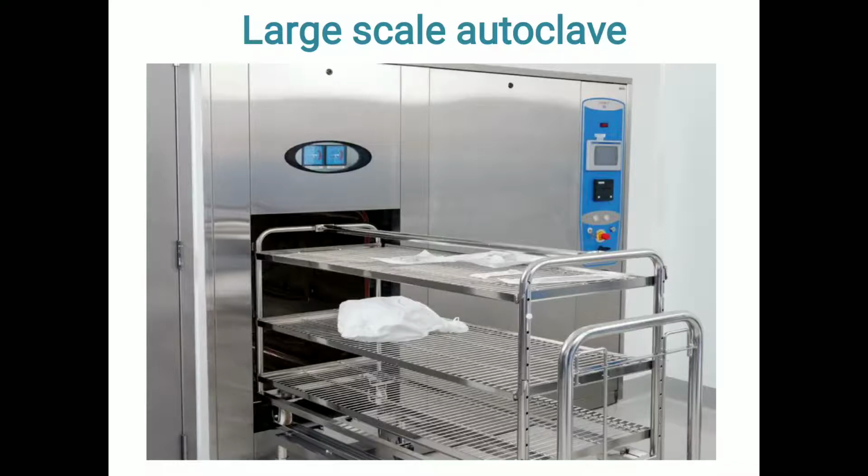The sterilizing equipment sterilizes the materials by exposing them to steam under high pressure, thereby making them free from any contaminants. So this sterilizer uses a temperature of 121 degrees Celsius and a pressure of 15 psi. So it can be used to sterilize the items, but as the heat takes much longer to be transferred to the organism, both the time and temperature must usually be increased unless forced ventilation of hot air is used.